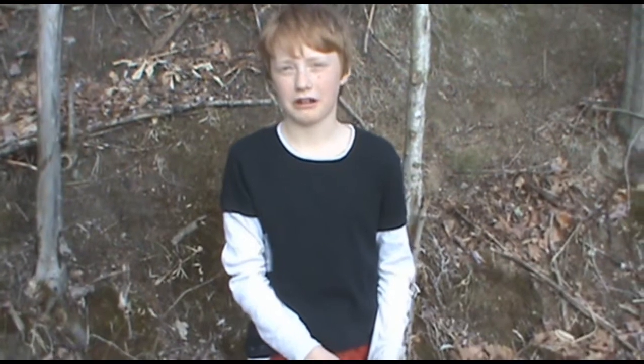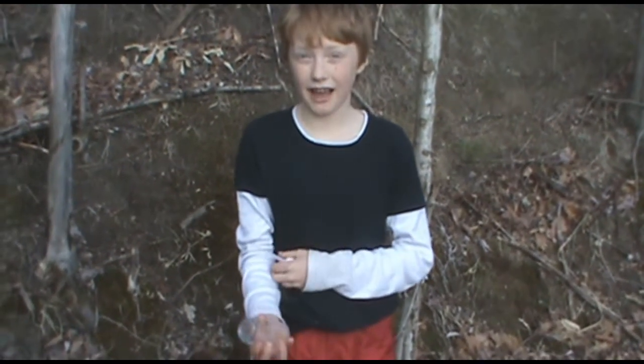Hi. Today I'm going to tell you how to do a water test. First, we need to get our water.